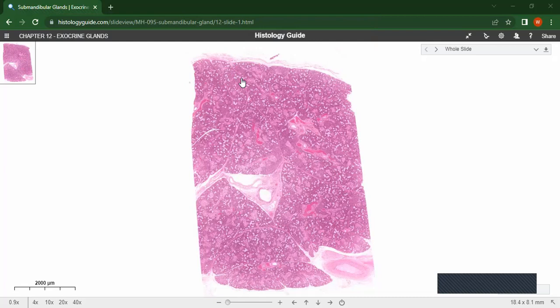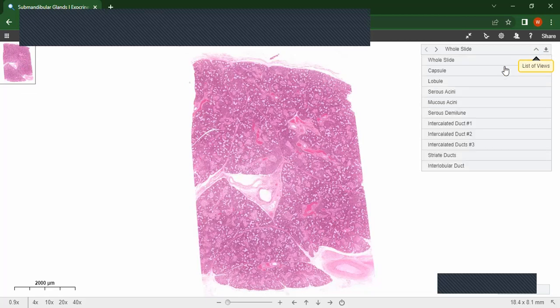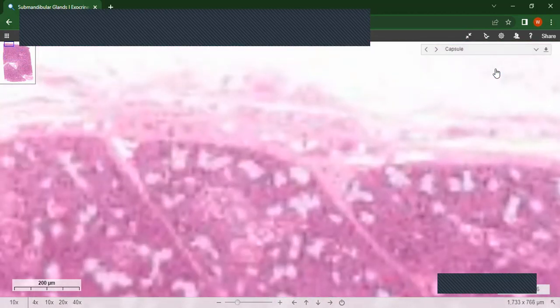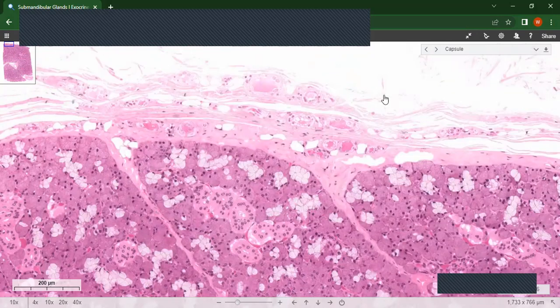It is seromucous, so it has both serous and mucous glands. Let's have a close view of the capsule. You can see this is the capsule.